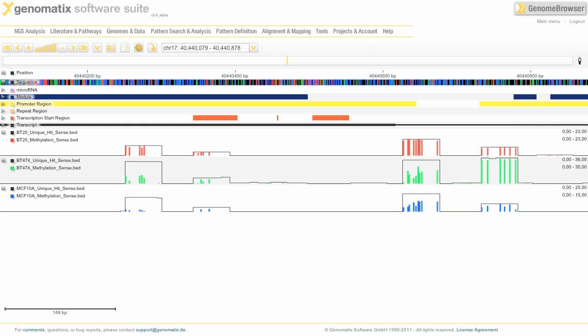The last thing I wanted to show you is how you can visualize DNA methylation patterns in the genome browser. Here I've preloaded three cell lines, the BT-20, the BT-474, and the MCF-10A. And for each I've loaded two files. The unique file will give you information about the overall coverage, and the methylation file will give you information about what regions are highly methylated.